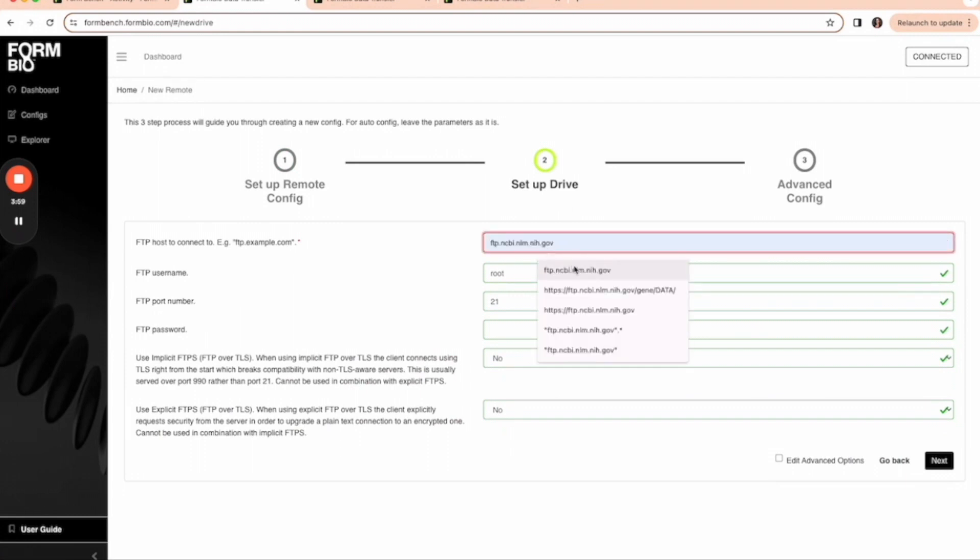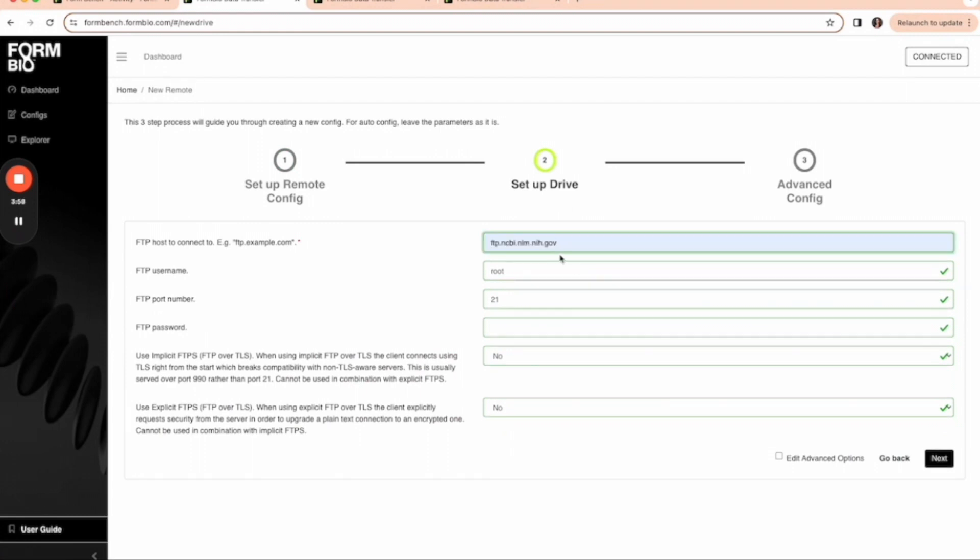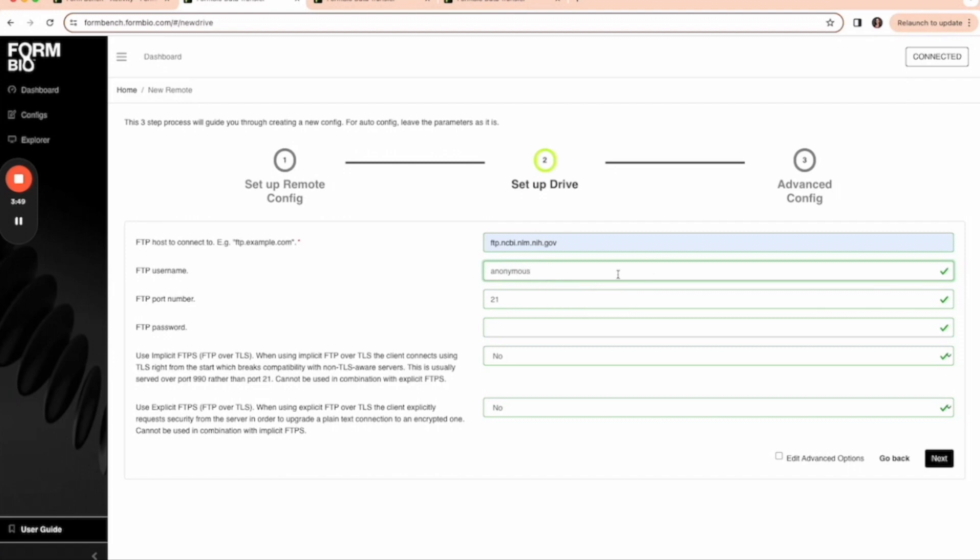Next I'm going to give it an FTP URL. I'm going to make sure that the username is anonymous and that the password is also anonymous.